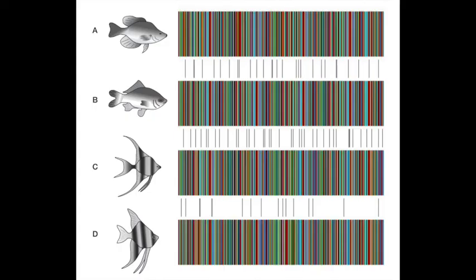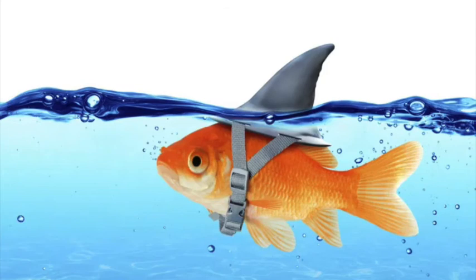This is where you will be picking up the lab this year. So we have samples of sequences from the CoI gene from different fish that you will be able to analyze using bioinformatics to develop barcodes for these fish. This will allow you to determine what species of fish you are dealing with from your sample. By analyzing your sequencing and bioinformatics results, you will be able to determine if the fish truly is the species it is labeled to be, in this case, fake labels that I made.